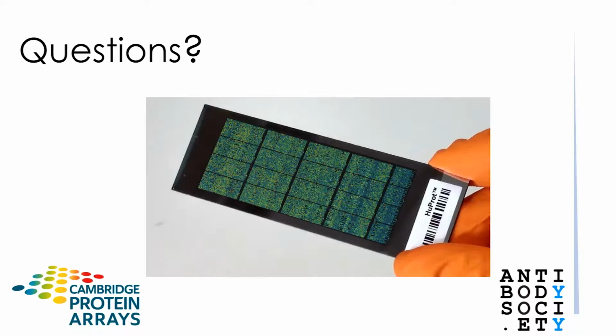As I pointed out, if you're looking for specific conformations of 20,000 proteins, but you know very little about the activities of these proteins, it's hard to know what criteria to use. However, we have many examples by now of antibodies which are dependent on protein conformation and which will react with the arrayed proteins. And therefore, we have a pretty confident feeling that many, most, if not perhaps all of the proteins are in fact properly folded. Now, a particular problem arises with membrane proteins which require the lipid environment for their folding. There, one might be able to determine specificity of linear epitopes, or one might have to, for confirmation, turn to arrays which are coming on the market in which the proteins are expressed in a lipid environment to maintain their folded form.